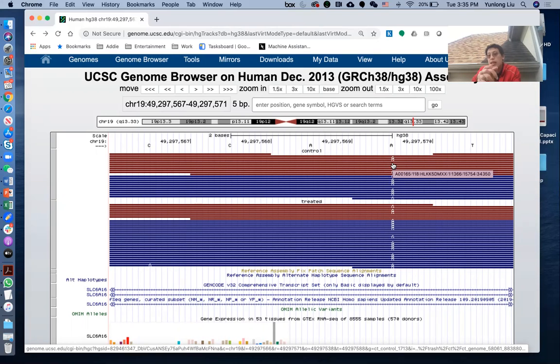Of course, ATAC-seq is not specifically designed to identify genomic mutations, but nevertheless, we can see it. And if it's DNA sequencing, and someone tells you there is a heterozygous variant in this location, you can potentially go there and take a look. Okay, so that's the point I want to make for this part.